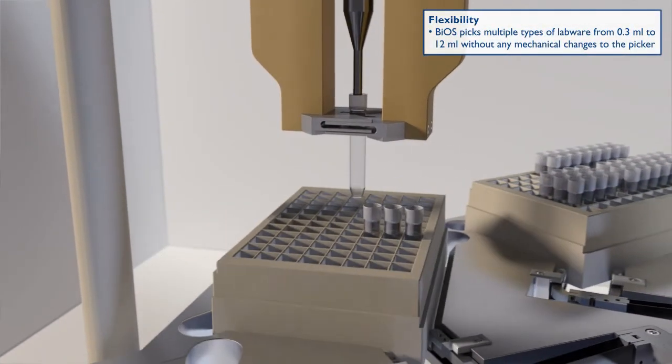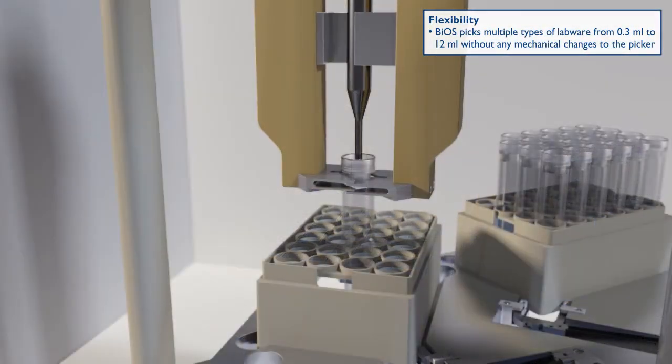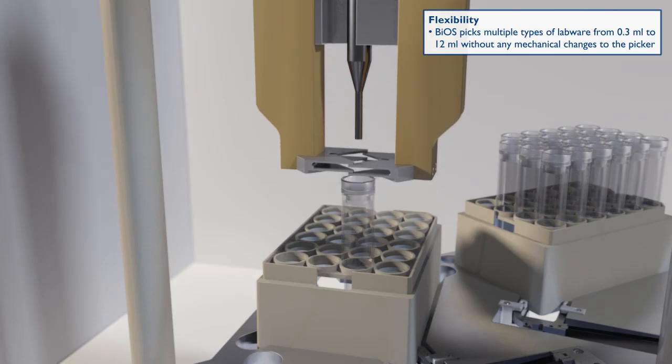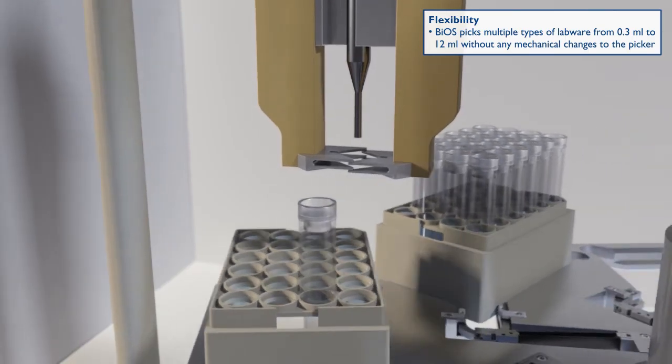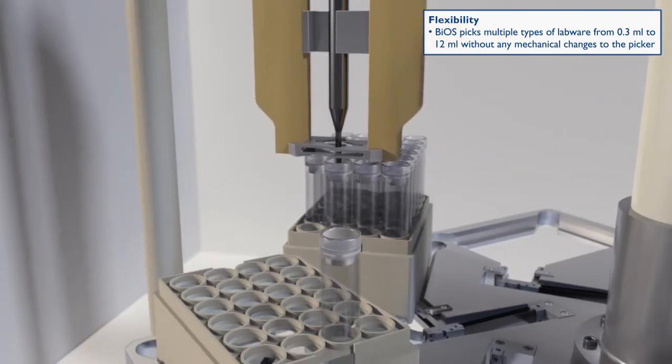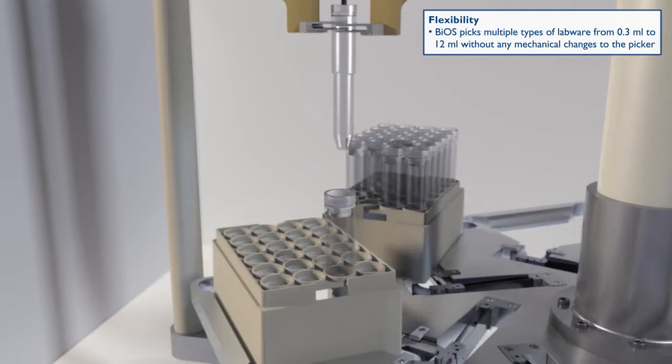Another unique feature is the universal design of the picker, being able to sort tubes from 0.3 milliliters up to 12 milliliters without any mechanical changes to the device.